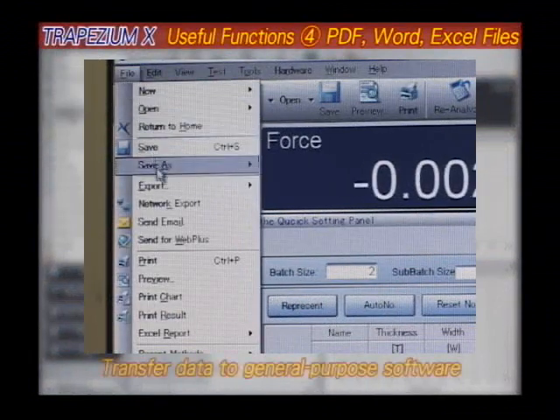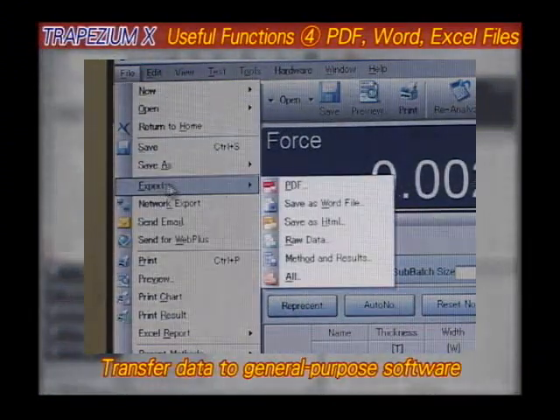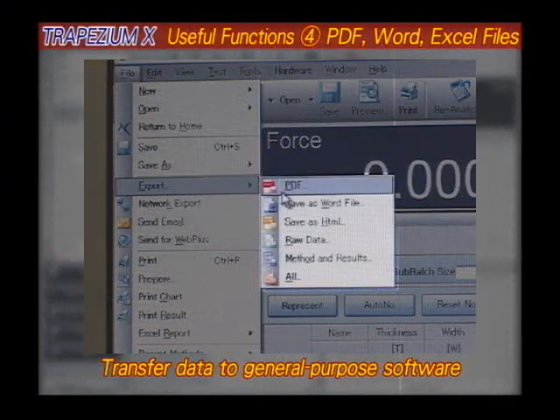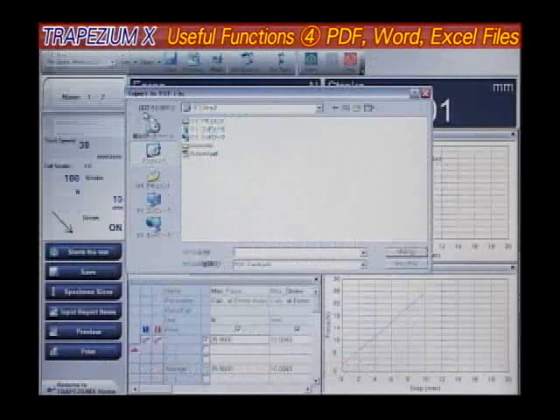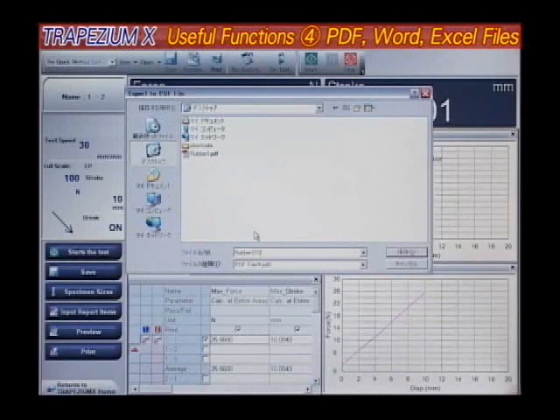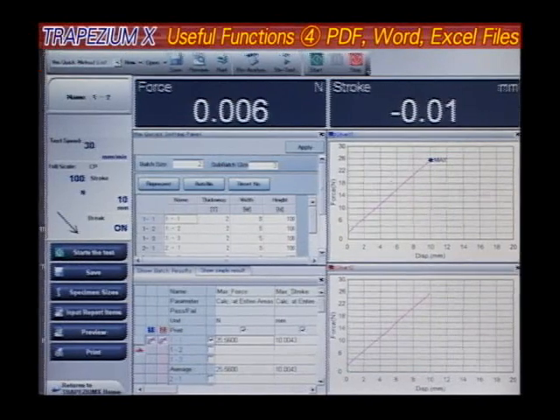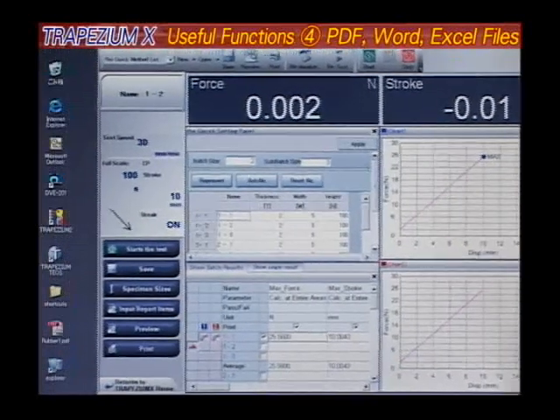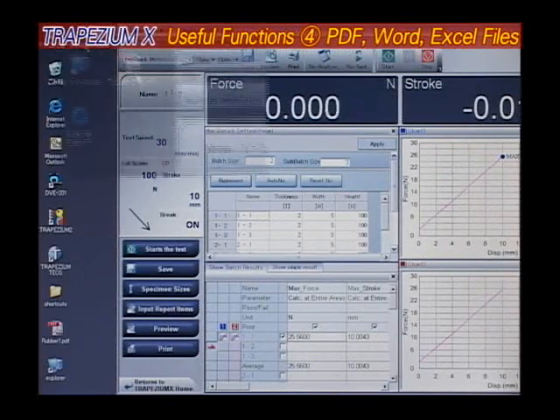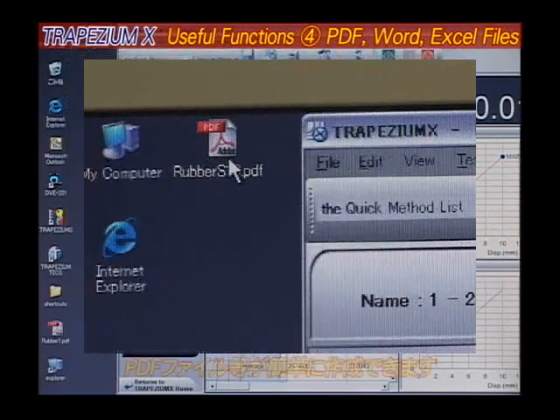Compatibility with PDF, Word, and Excel formats. Test results calculated using Trapezium X software can be easily transferred to general-purpose software such as Acrobat, Word, or Excel.